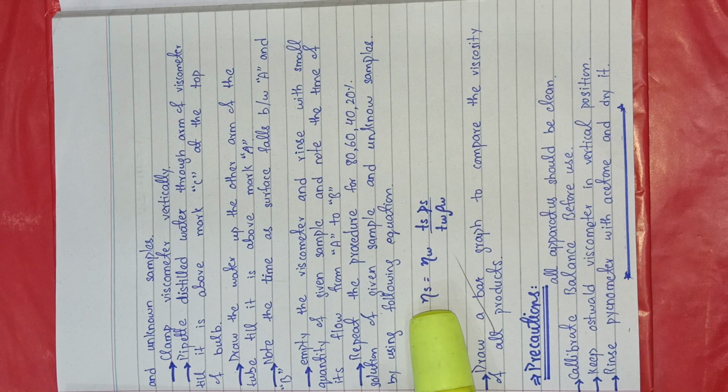So you are going to repeat this procedure for 80% solution, 60% solution, 40% solution and 20% solution. You will prepare each solution and one by one detect the viscosity of these solutions, and then you will write down all of these answers in your practical book.